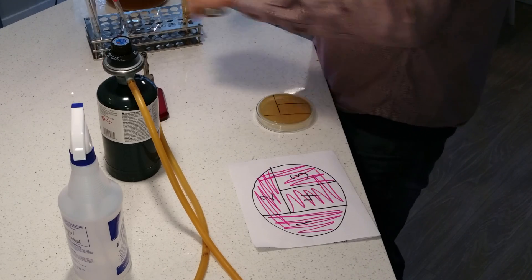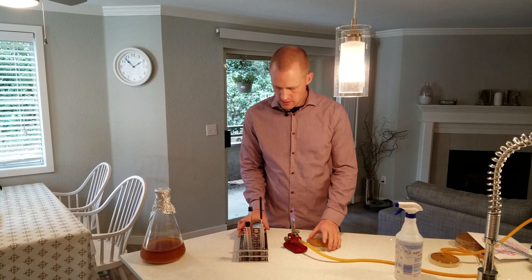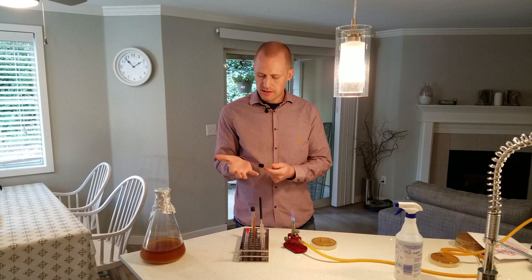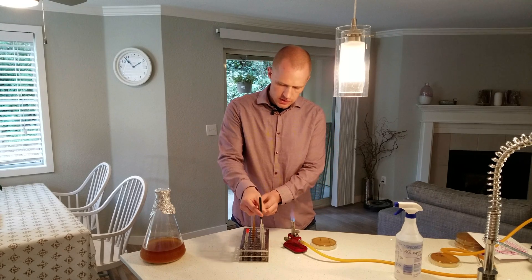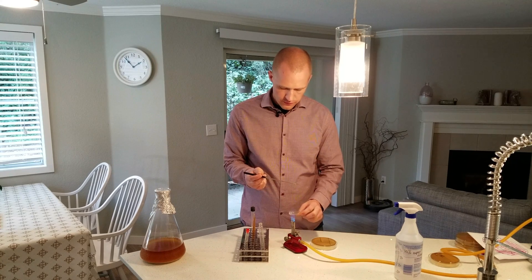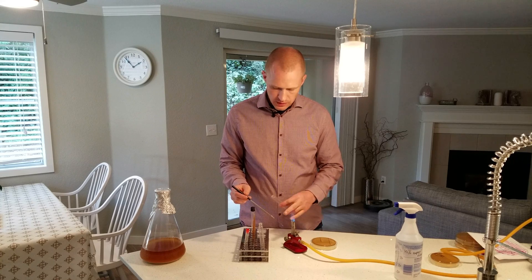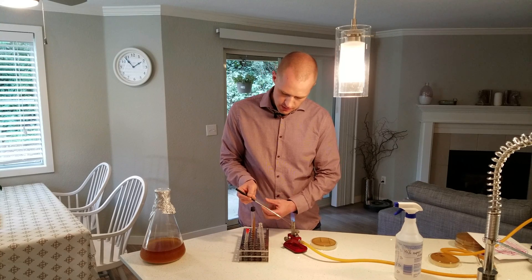Go ahead and light the Bunsen burner. If you had a sample of yeast in a tube, the aseptic method is: grab it, and using your pinky finger hold the cap. Then unscrew it, flame the opening, grab the sample that you want, take it out, and hold it next to the flame — but not so close that you destroy your sample. Then re-flame and close it again.